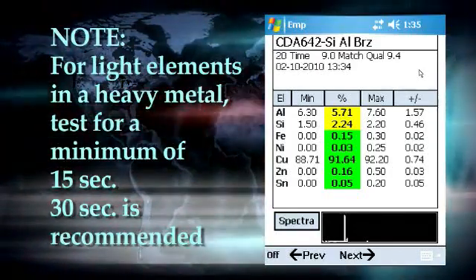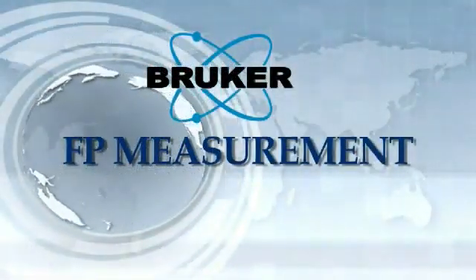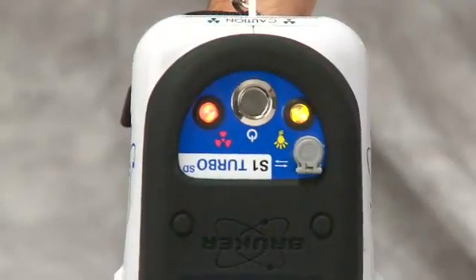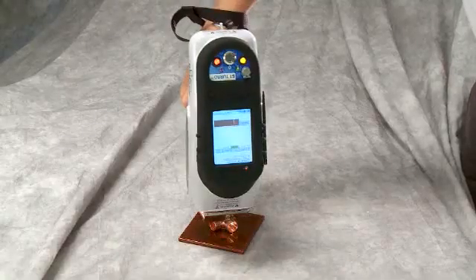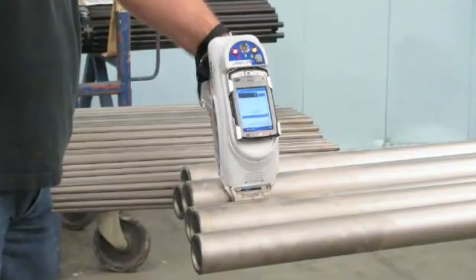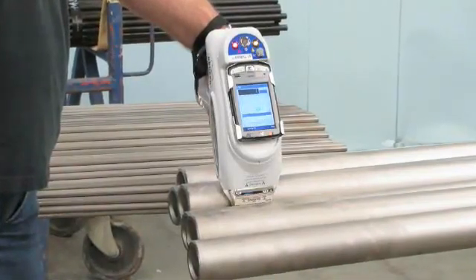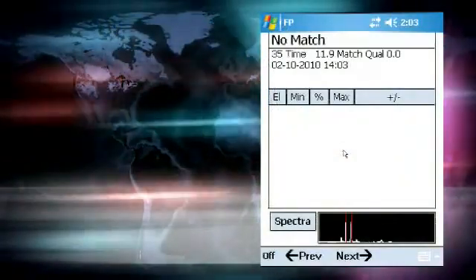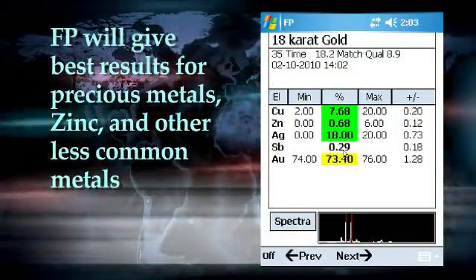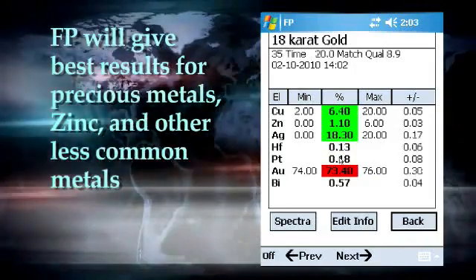30 seconds will provide an accurate analysis of the light elements. Fundamental parameters analysis is the best technique to measure any sample which is truly unknown. If you are measuring a common alloy such as steel, copper, or nickel alloy, it is probably within the boundaries of the empirical calibration. However, unusual alloys fall outside of the calibration boundaries and the empirical analysis may be compromised. Fundamental parameters analysis may not be as accurate as the empirical analysis, but it will provide much more accurate results for samples well outside the boundaries of the empirical calibration. For completely unknown samples and alloys such as precious metals, zinc alloys, and other less common metals, fundamental parameters analysis will give the best results.